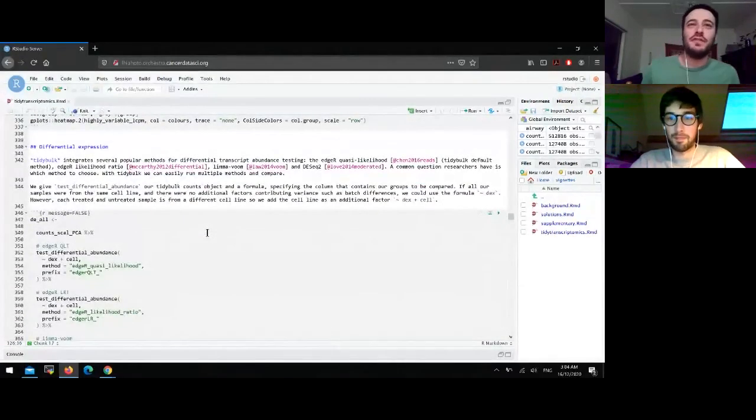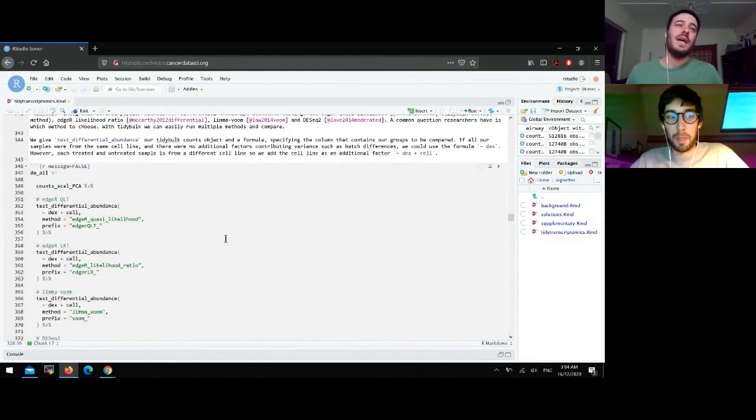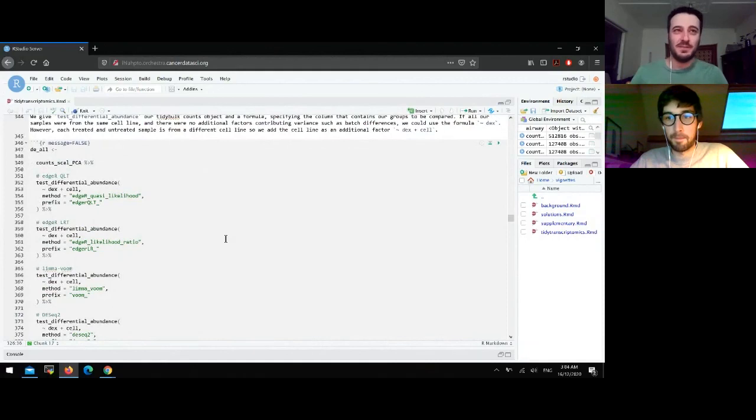Okay, so for differential expression analysis, there are many methods out there that you might know. DESeq2, edgeR that has many kinds of analysis streams. limma-voom, same, has a few different analysis streams. And their syntax and the jargon they use is quite different. And so some of us end up choosing a preferred method and using that, because the burden of testing one method after the other is quite high. And we expect the results to be kind of compatible.